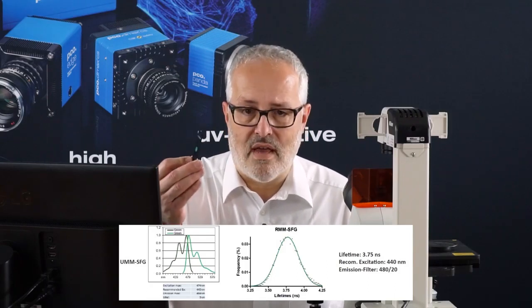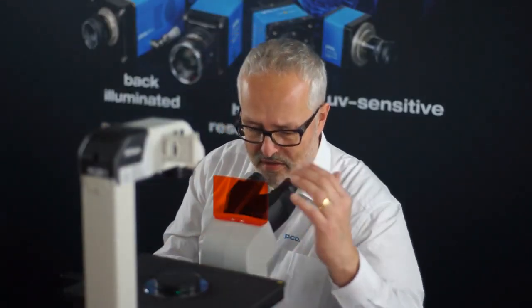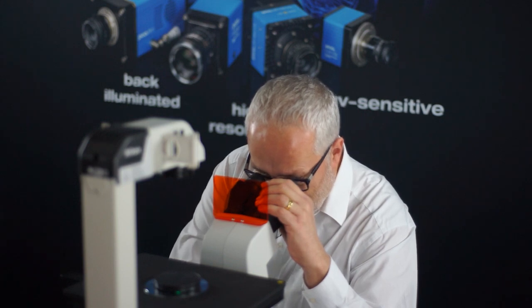With the adjusted camera controls, with all the settings that you need for your later measurement, you make this measurement while placing the reference on the stage, switching on the light, covering it, and then focusing the microscope to the surface of that slide. And when you're ready with the focusing, you can switch to the camera and continue with the rest of the measurement within the software, which is in our case Nikon NIS Elements that controls the whole system.